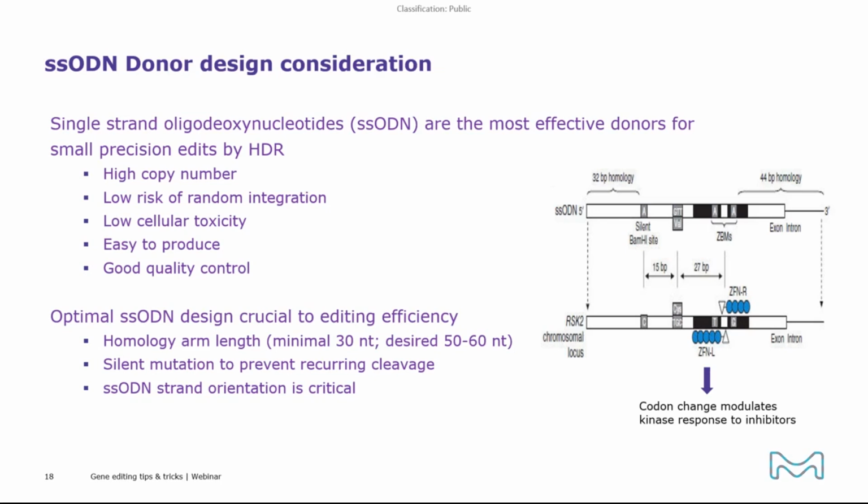And most importantly, the oligo strand orientation must follow the positional relationship between the edit site and the cut site. And I will illustrate this relationship in the next two slides.